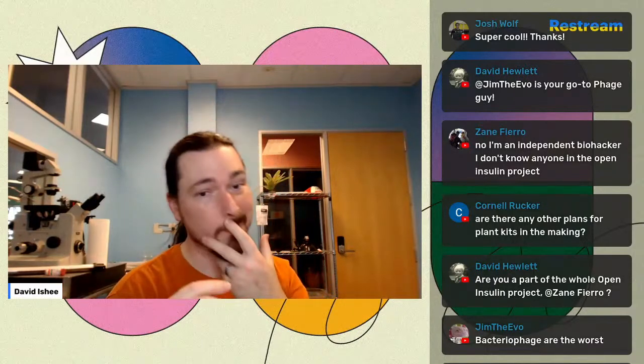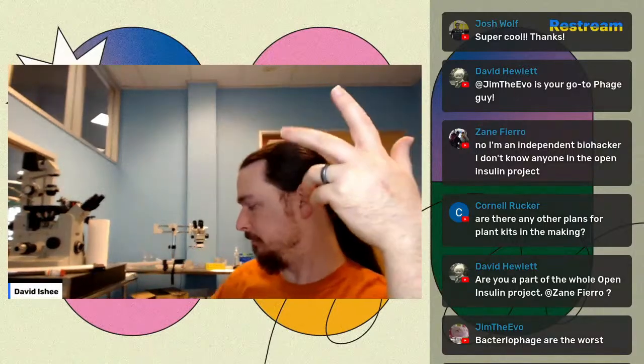The next one we're going to do is work on adding more genes of interest, right? So you get a little library of genes. So you'd be like, okay, I'm going to take this one makes yellow, this one makes red, this one makes blue, this one makes purple. Blue might be hard. And you can just make your own custom design with lots of different colors. Because for the most part, that's really what we want. Might do something with smells later. But the main thing is going to be colors, because it's permanent, it's easy. It's visually interesting, and it's really easy to tell if you succeeded or not. Very clean signal.